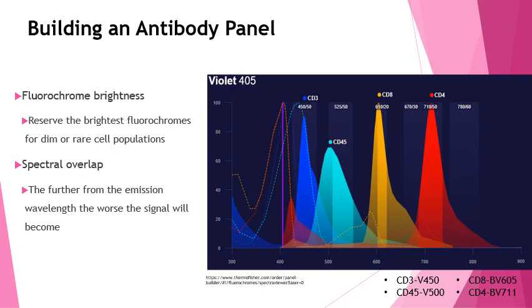And one of the hardest things is figuring out the fluorochromes that will work in your panel. Fluorochromes can be conjugated to any antibodies. A lot of different companies will have your CD8 bound to multiple different fluorochromes. They could be bound to FITC, which is a pretty common one, PerCP-Cy5.5, APC, etc. There's just a ton of different fluorochromes that it could be bound to.